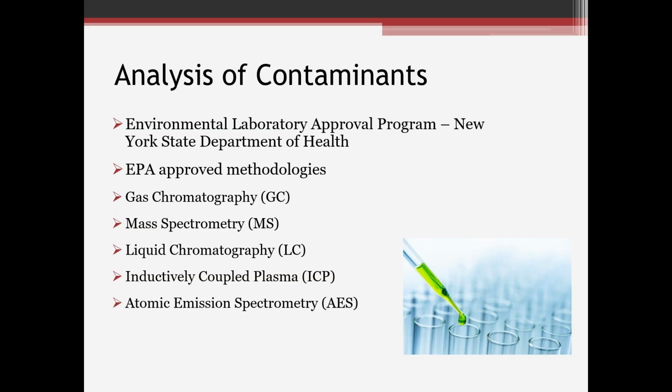They will review and approve methods that can be used for analysis on sites in New York State. So any of those analyses, especially the contaminants that we are talking about today, will have ELAP approved methods that are implemented. So you know when you send it to a lab that there is some standard of practice that they have to adhere to for those samples to be analyzed.